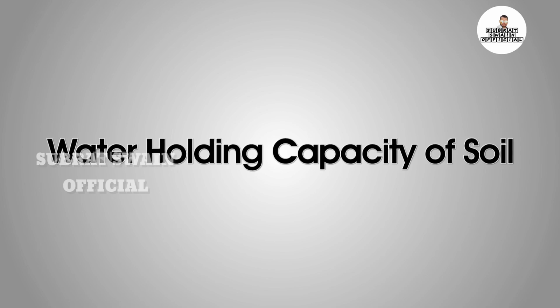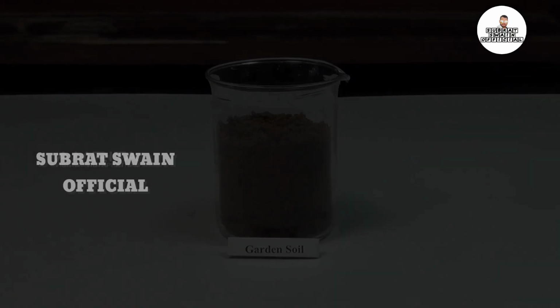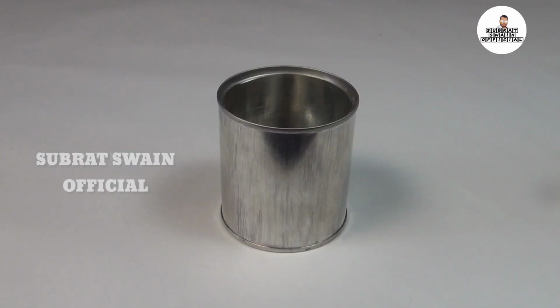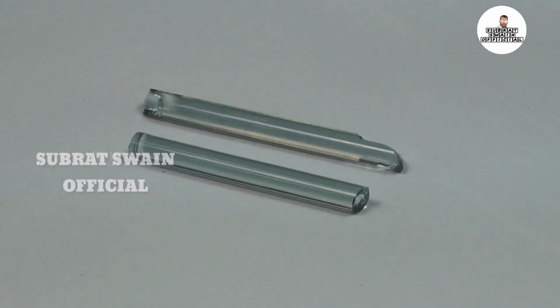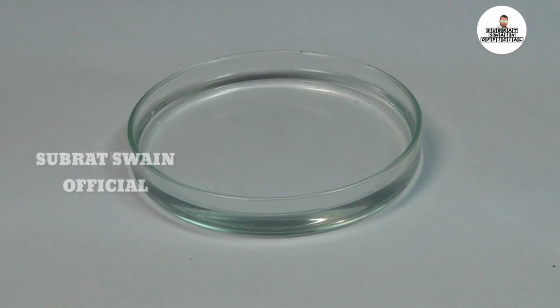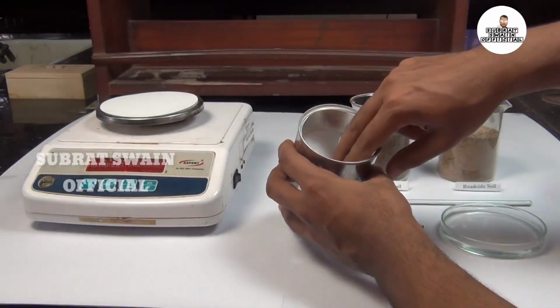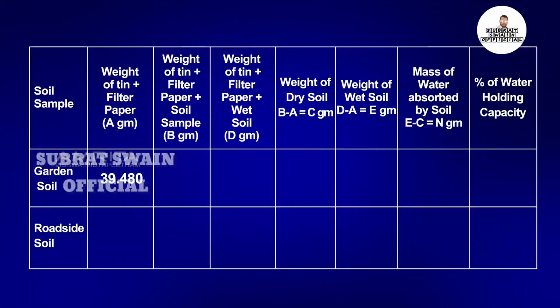Water holding capacity of soil. Materials required: garden soil, roadside soil, tin boxes with perforated bottom, filter paper, glass rod, small glass rods, petri dish and weighing balance. Procedure: take a filter paper and place it in the bottom of a tin box. Weigh the tin along with the filter paper and note its weight.